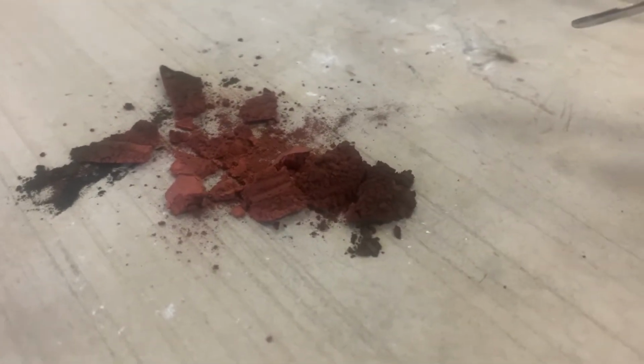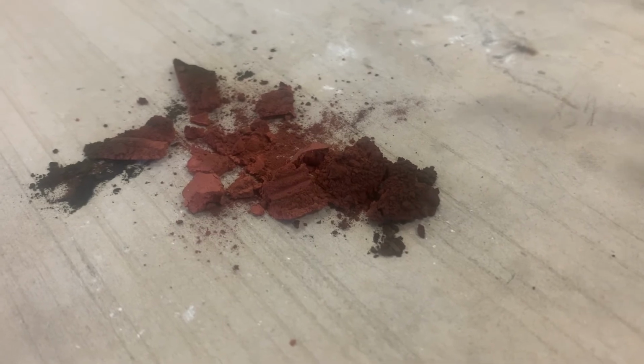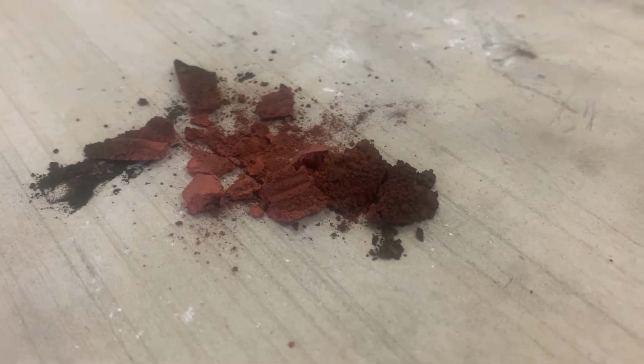So remember, this reaction showed the reduction of copper oxide. So copper oxide had oxygen removed from it and it was turned into copper.